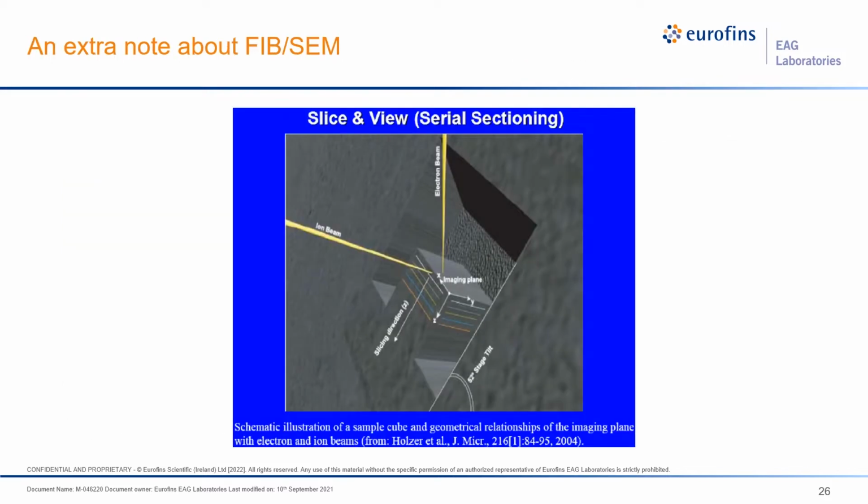I just want to give a brief introduction about this idea. For TEM sample preparation, you slice away material and visualize from the cross section.